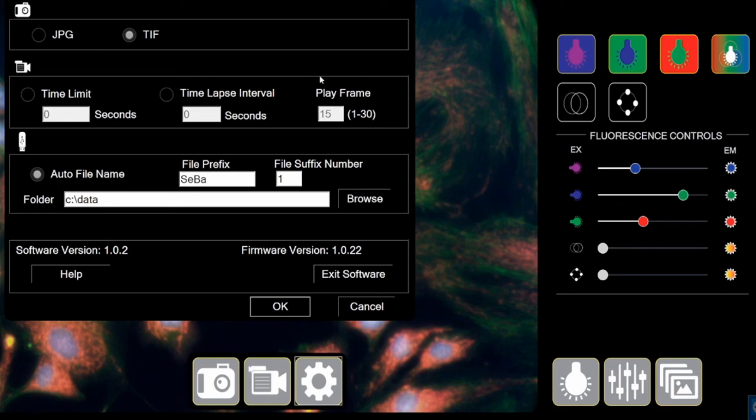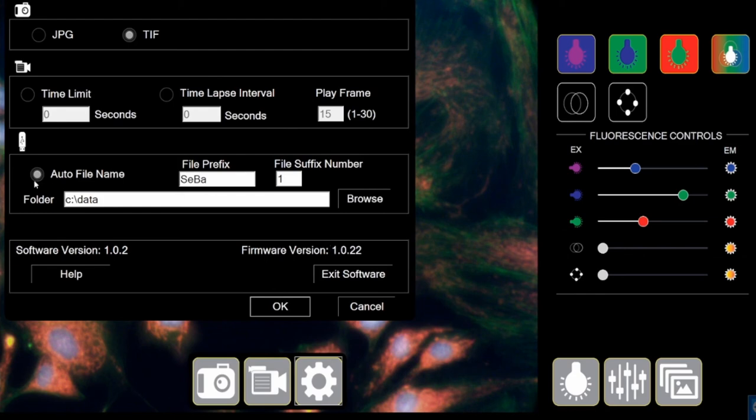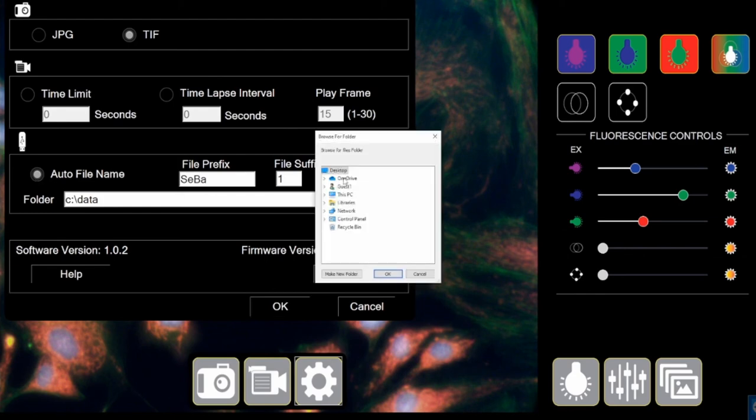This is your time-lapse box. You can define the time limit and the time intervals for your experiments that you need the images taken on or the videos recorded on and then you have the frame rate selector. This is where you decide where on your system would the images and the videos be stored at. And that's it. That's how easy this console is.